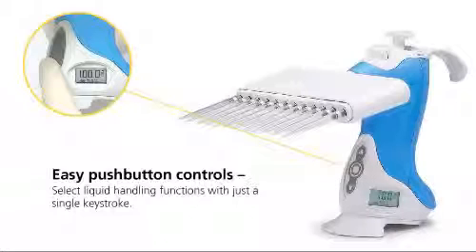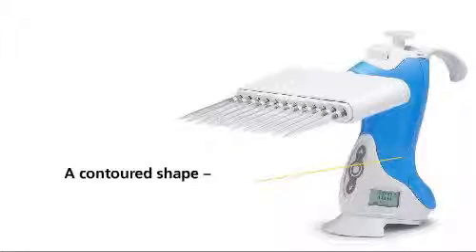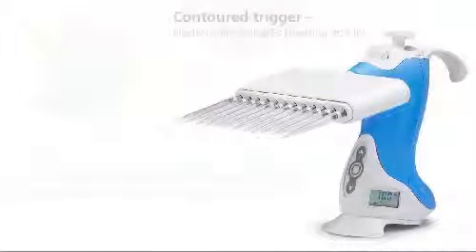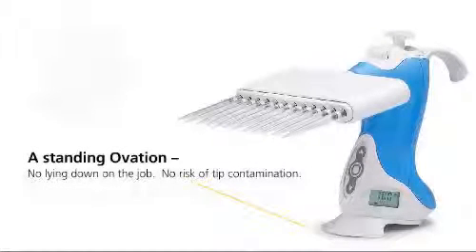And if that liquid handling function needs to be adjusted, the parameters are easily changed using the pipette's intuitive menu. Like all Ovation pipettes, the body's contoured shape fits naturally into the palm of your hand and allows pipetting to be performed with a neutral posture and minimal muscular movement. Every user gets a custom fit with Ovation's adjustable hook, which ensures maximum comfort without contact pressure — a tight hand grip is never needed. The Ovation pipettes stand securely on the counter, so they're easy to pick up, and you can even put them down in the middle of a procedure without the risk of tip contamination.